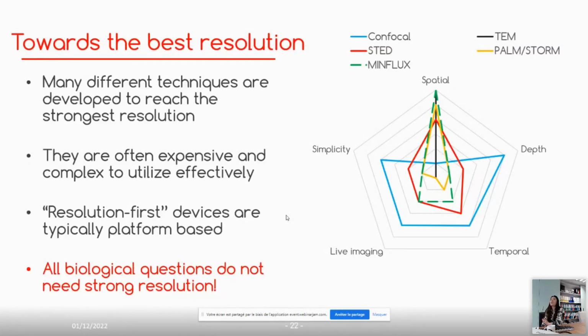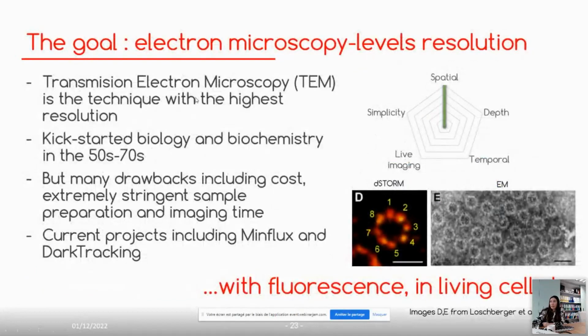And they're great. However, like I said right before this talk even began, not all biological questions necessarily need the strongest resolution that the market can offer. Not everybody needs to see these individual molecules, and some structures don't have any refined things happening below the diffraction limit. So the goal of where these types of products are headed is to try to match what electron microscopy has typically done for the field.